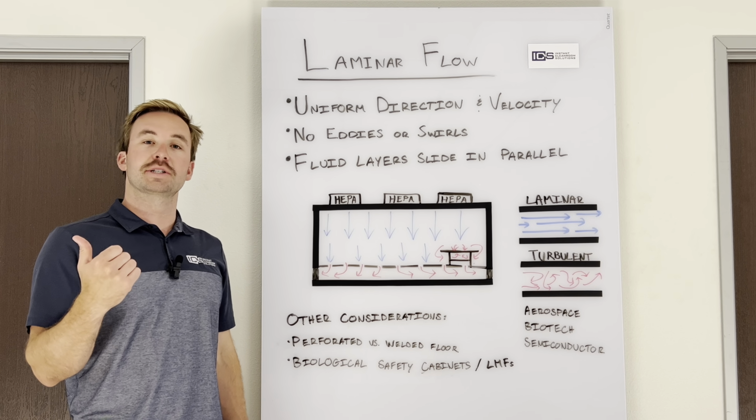So clean rooms need to breathe. They need to have a return. They need return air. And if they don't have return air, then you're going to have eddies, or you're not going to have the proper airflow required to maintain your ISO level.